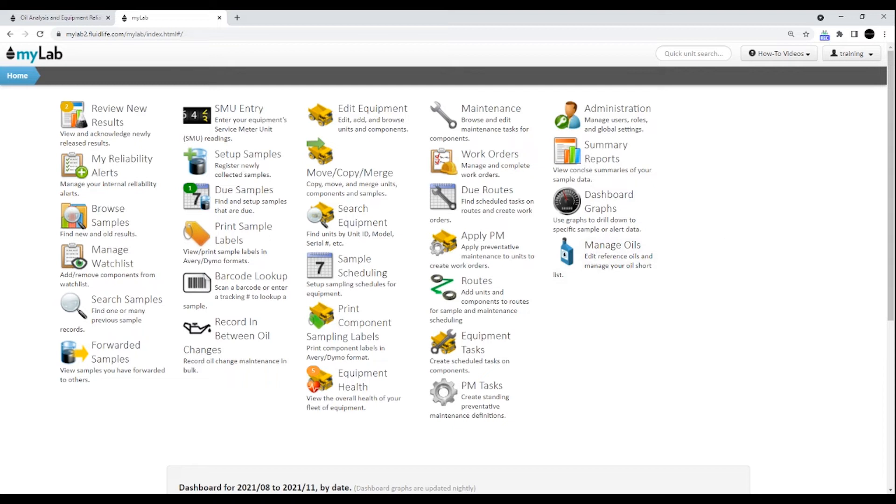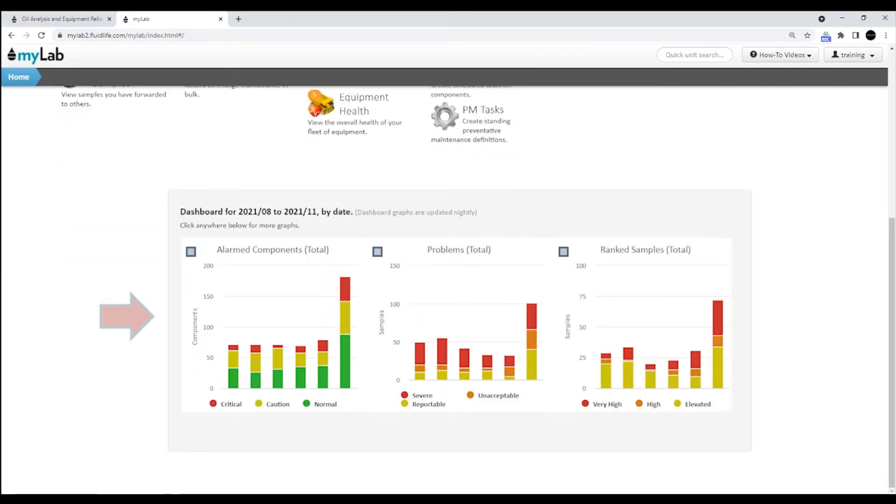To start a new task, all you have to do is click on any one of the tasks on the homepage. At the bottom of the homepage, you'll find a summary dashboard of all the important sampling and condition monitoring information that you need.